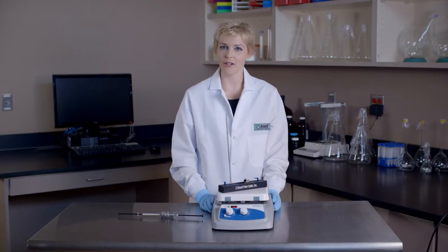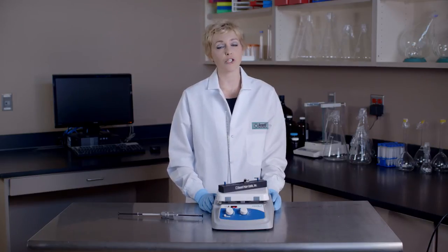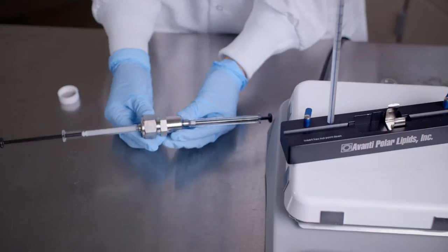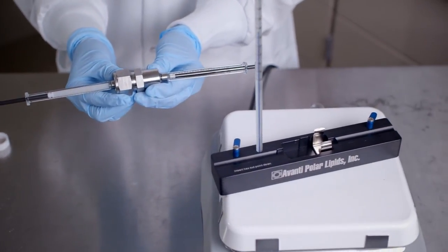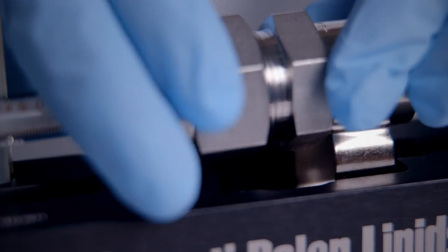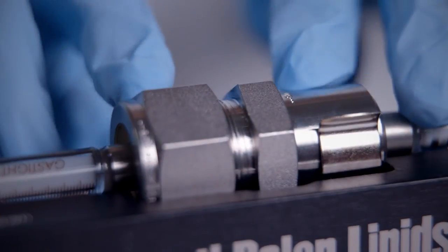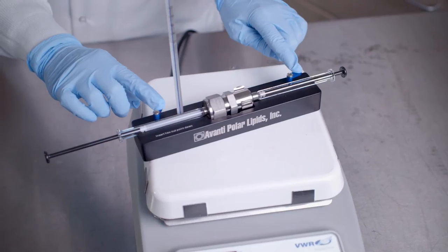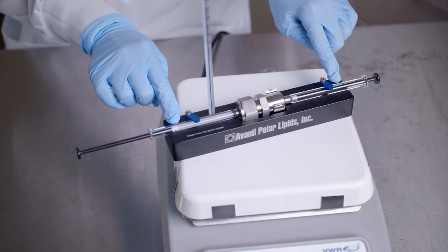And now for the most important note. The extruder apparatus must be fully assembled prior to insertion into the heating block in order to prevent damage. Now we're ready to insert our fully assembled extruder apparatus into the heating block. Insert the hex nut so that any two opposing apexes fall within the vertical plane. Then use the swinging arm clips to secure the syringes into good thermal contact with the heating block.